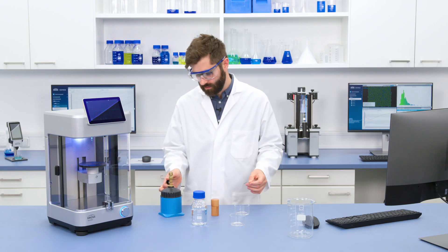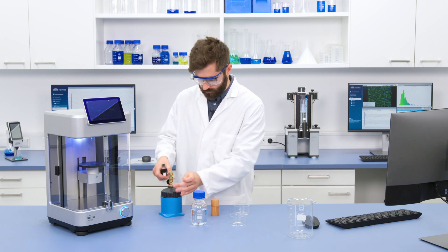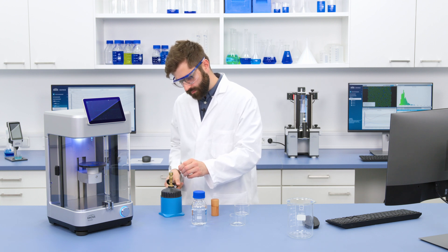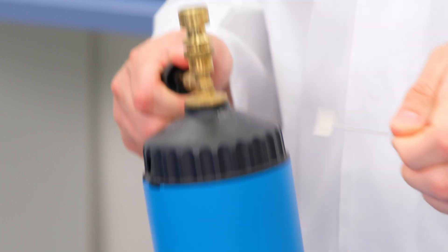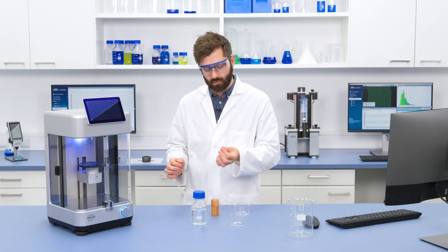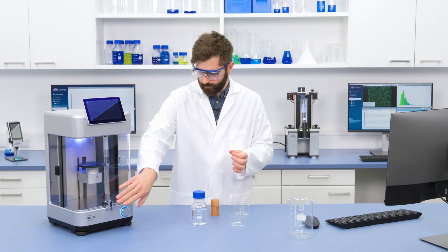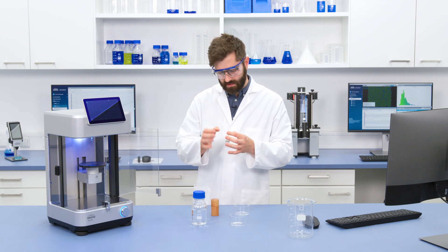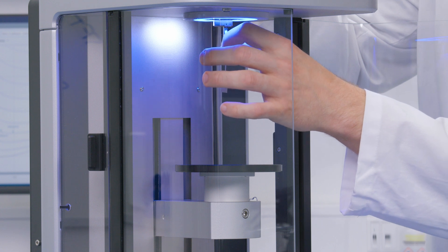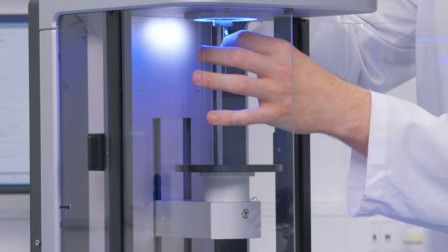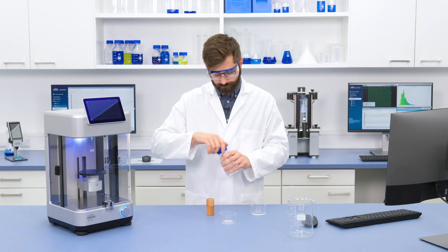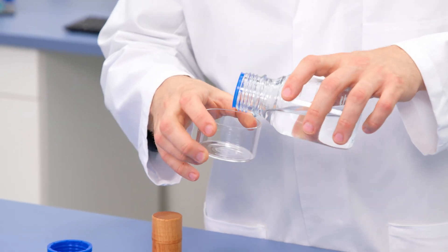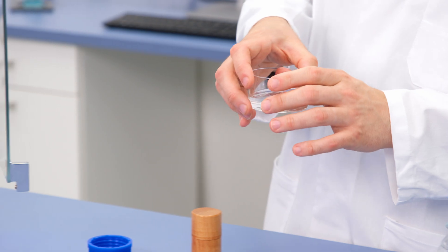We can clean it first by washing it with distilled water, and then I need to heat it up to activate it using a gas burner. I heat it up until the plate is just starting to glow red hot — it doesn't need to be white hot — and then let it cool down a little. Now that it's ready I can put it into Tensio and attach it to the force sensor. The next step is to fill my sample into a sample vessel — in this case doubly distilled water — and place it onto the sample stage.